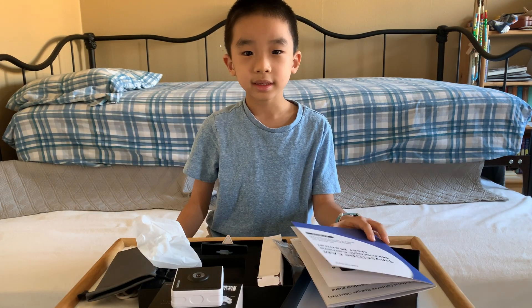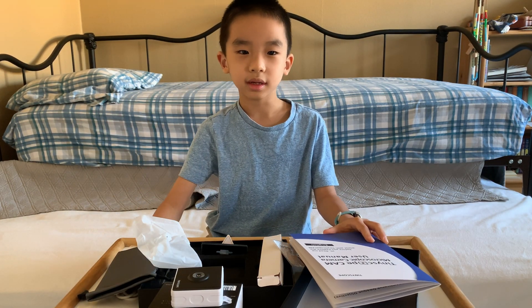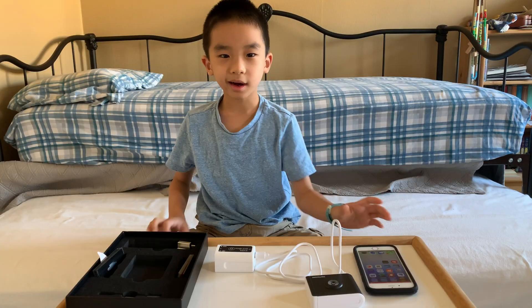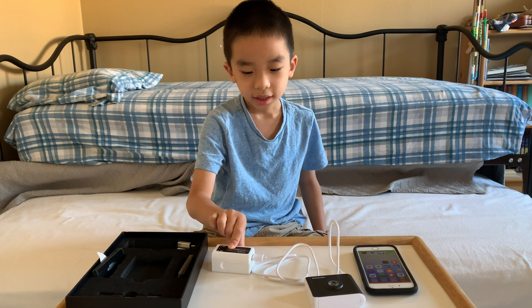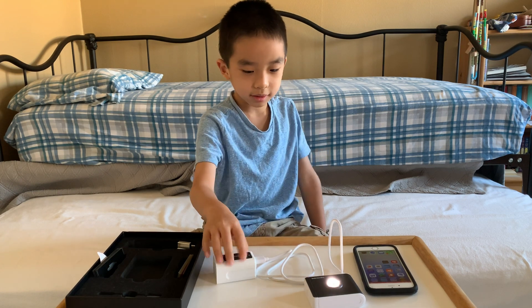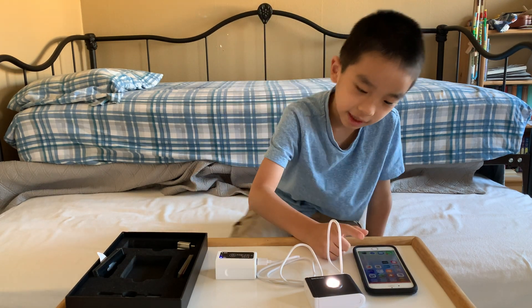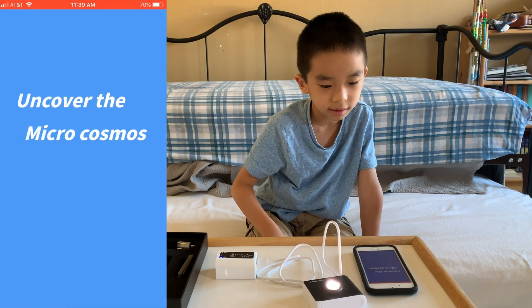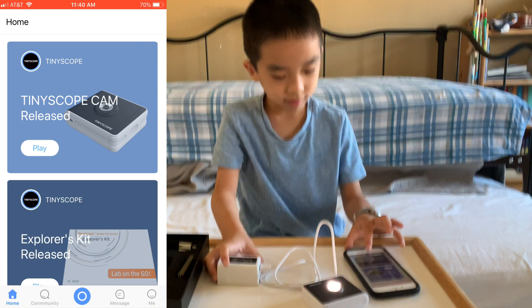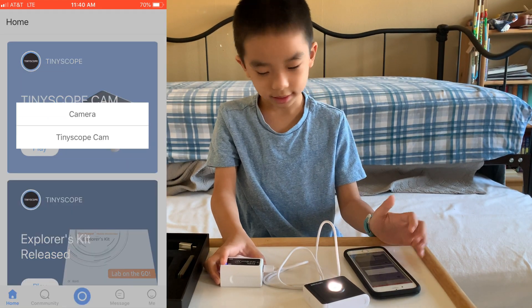Now we're going to set everything up and do a little demonstration. We got everything ready. We connected the wifi box to the Tiny Scope camera, now we turn it on. And then we downloaded the Tiny Scope app. So now let's press on it — Tiny Scope Cam.